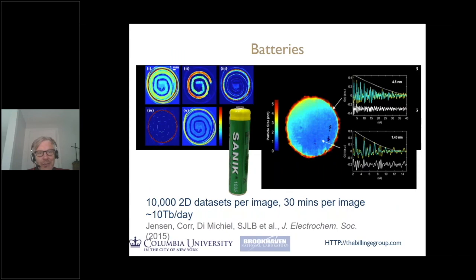In the X-ray case, we can also do computed tomography. So we don't have to have the sample sectioned. That's not going to be so possible in the context of electron diffraction. But I just wanted to show you that when you do this kind of nanostructure imaging, you can see multiple different signals coming from the same volume of space, and you can separate those images.